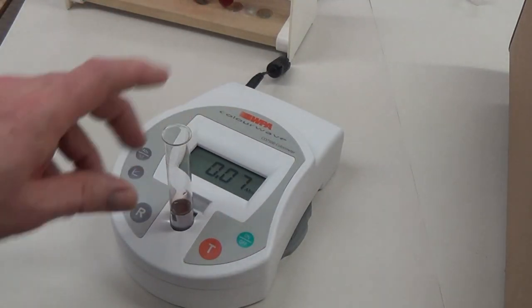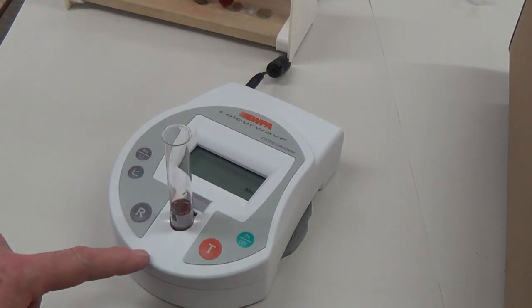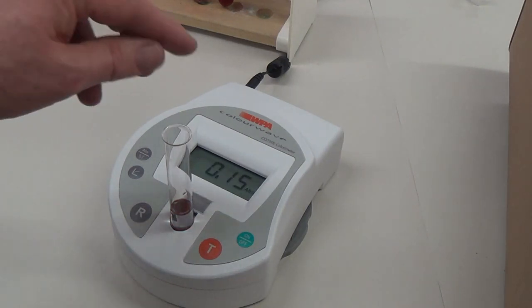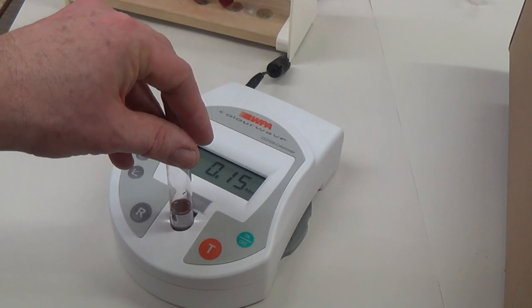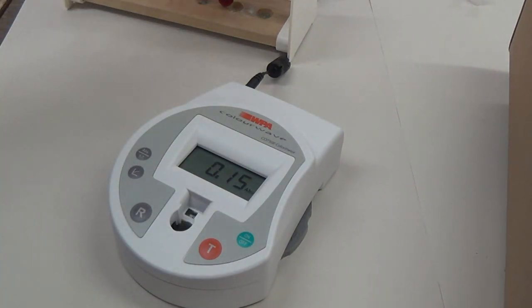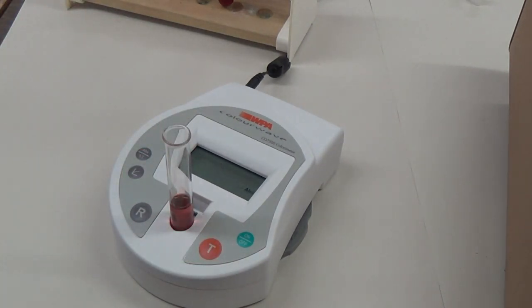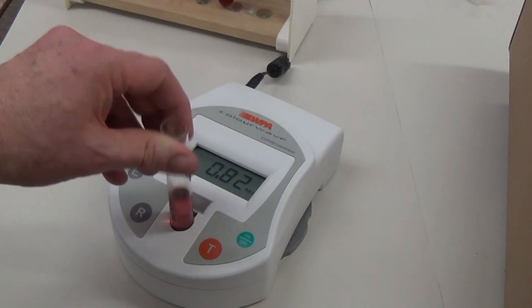Next dilution. These could be results from, for example, looking at beetroot pigments that have been produced at different temperatures, looking at the effects on the cell membrane of beetroot. 0.82.